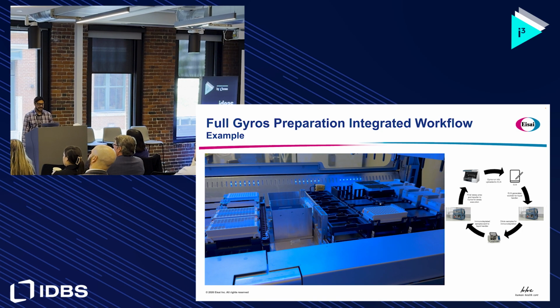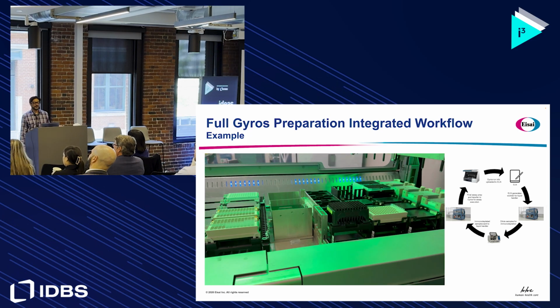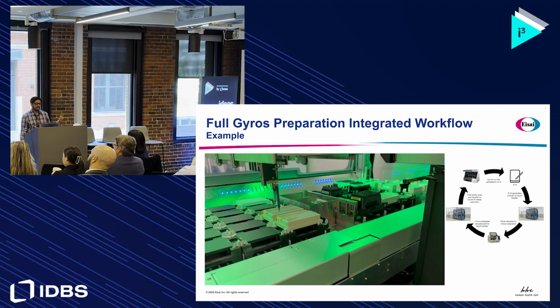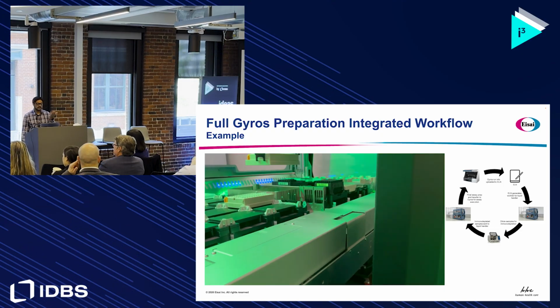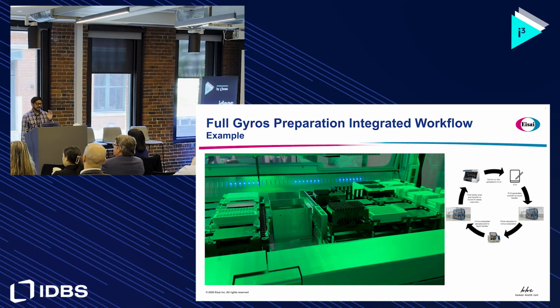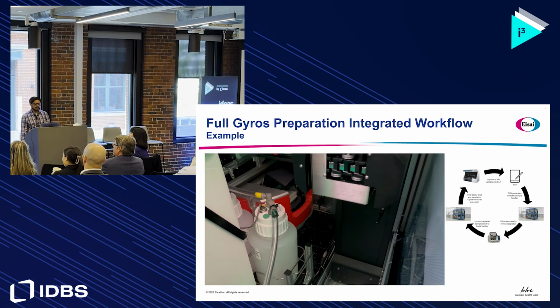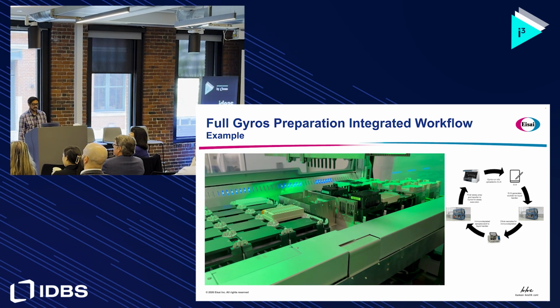It's going to barcode scan in all that stuff, make sure that you put it in the right spot, and then it executes. So this is all hands off. I'm not even here. I was actually at my desk and I just left my phone recording this. I was in a meeting while this was going on. I just set it and forget it.